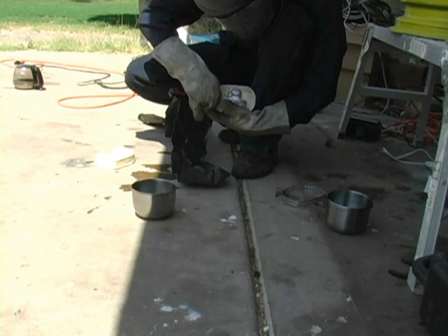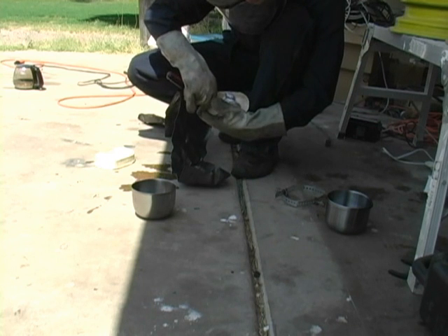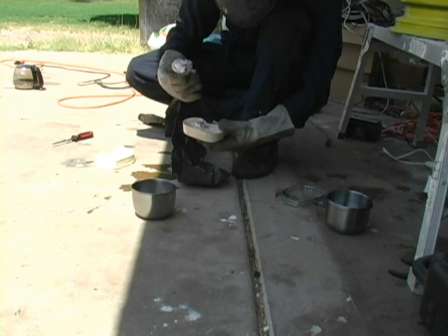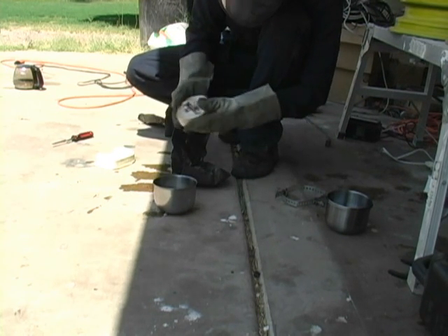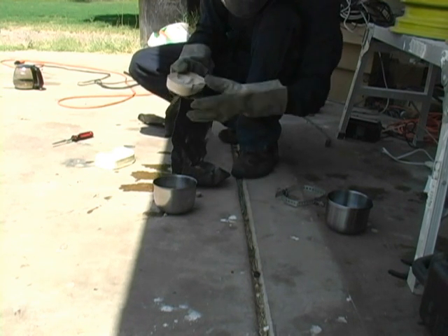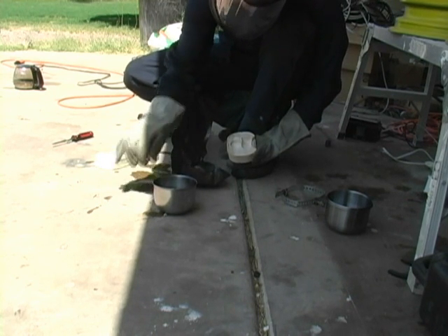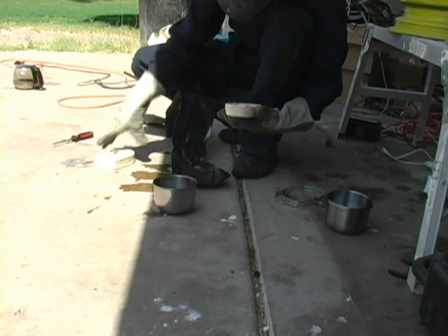You can see it kind of breaking apart there. Certainly not what we want. That's disappointing — the whole thing just crumbles into a bunch of little tiny beads. We're going to have to try that one again. That did not work. Let's get it a little bit hotter and see if it works any better.